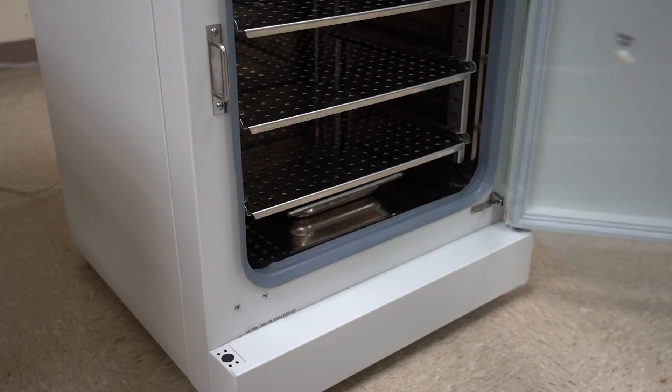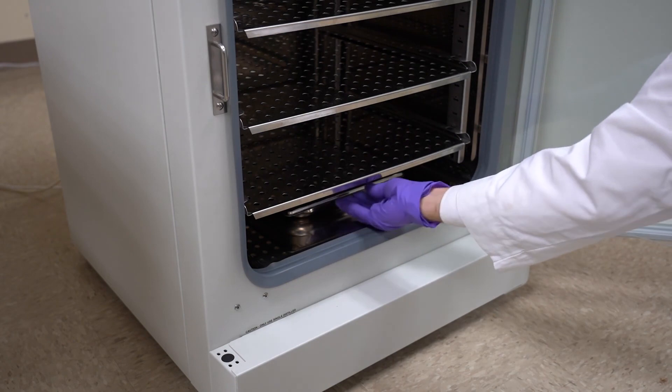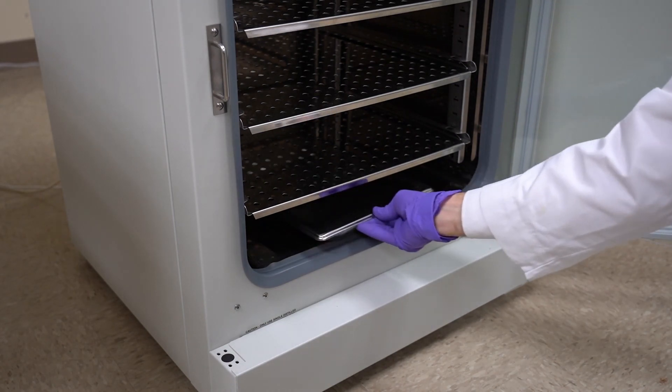Remove the water pan. On incubators with active humidity control, it is only used for calibration.